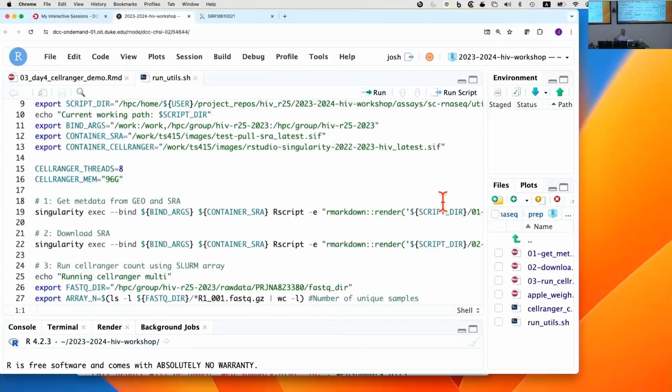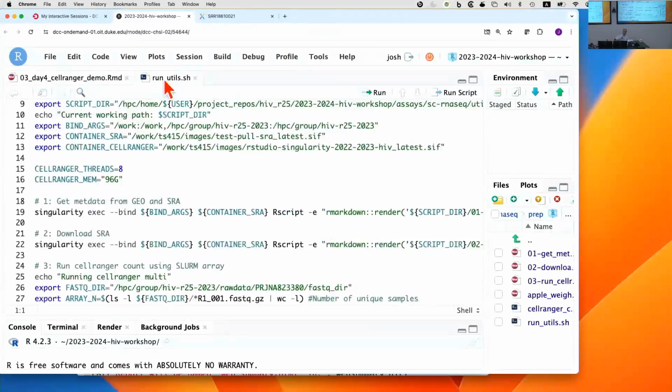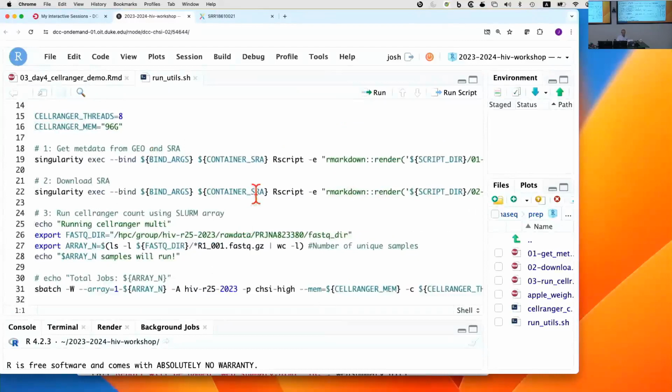And so you can start a group of processes where you want to run the same pipeline on a bunch of different input files. And that's what we do. Basically, for each of the input FASTQs, or each of the input samples, this R markdown gets run on a different file. It makes it really easy to say, okay, here are the files, here's the program I want to run on it, just do that. And so it can run on multiple separate computers independently.